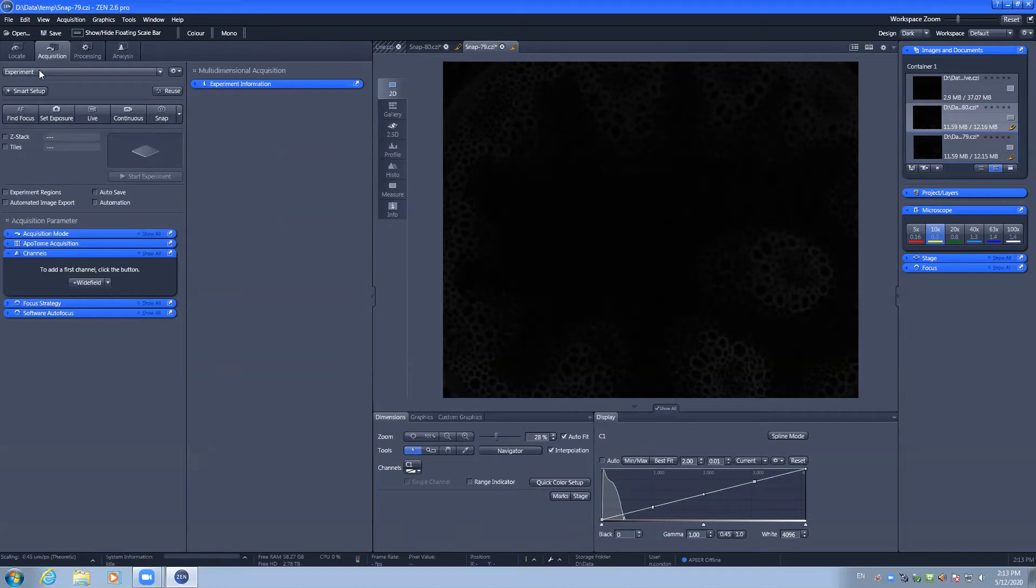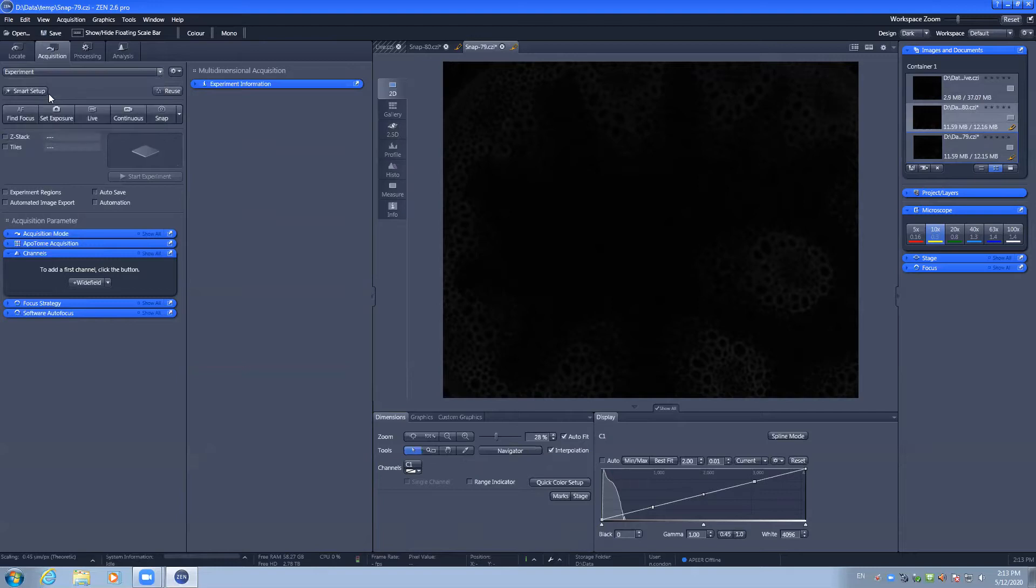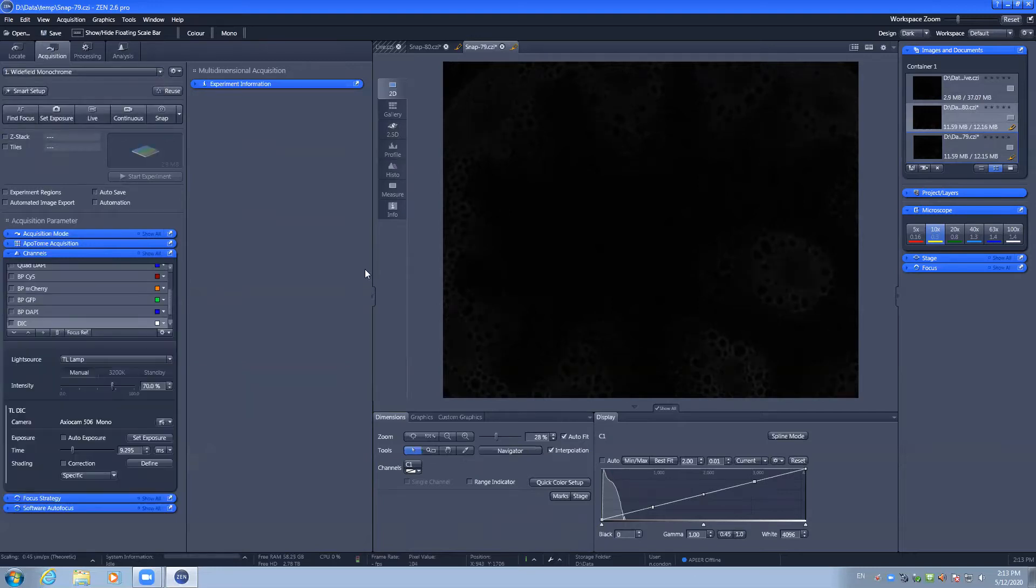To capture a standard wide-field fluorescence image, navigate to the Acquisition tab, select Wide-field Monochrome, and ensure that the camera slider is all the way out.